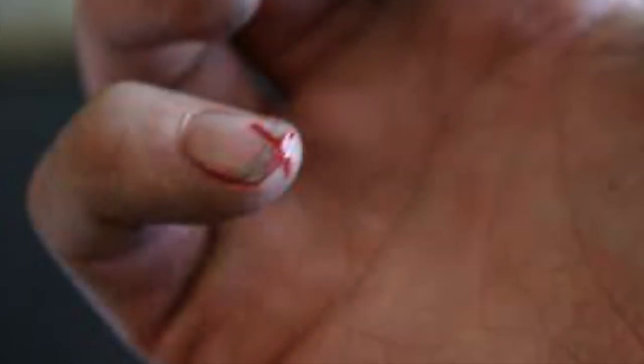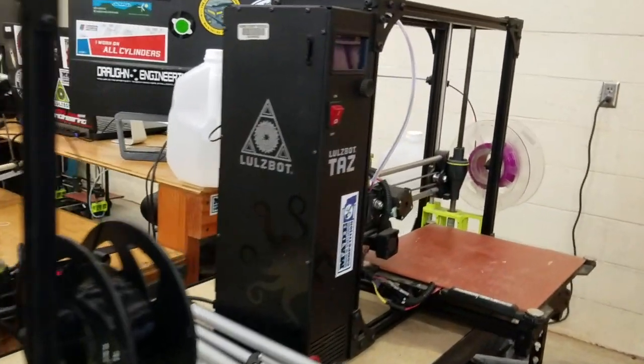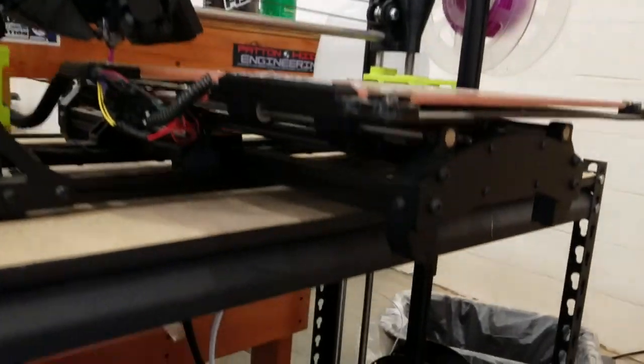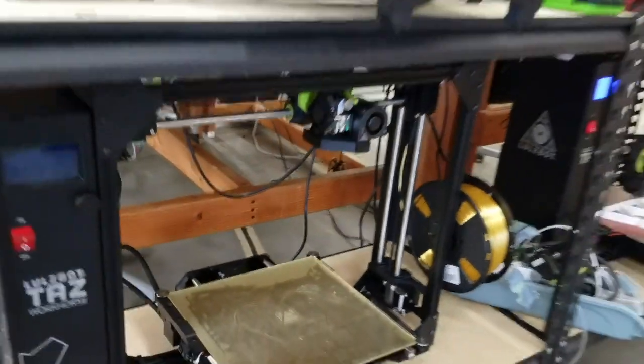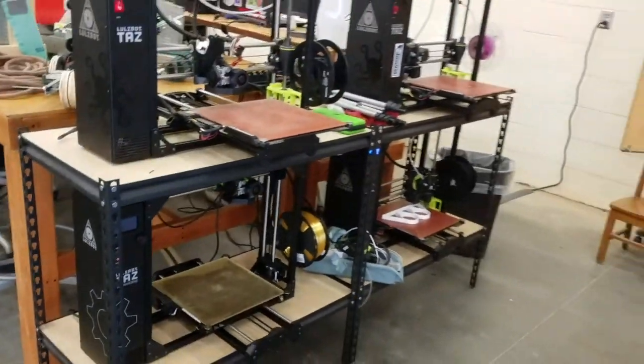All accidents should be reported to the teacher immediately, no matter how minor. Only materials and equipment authorized by the teacher should be used. Written and verbal instructions should be followed carefully.